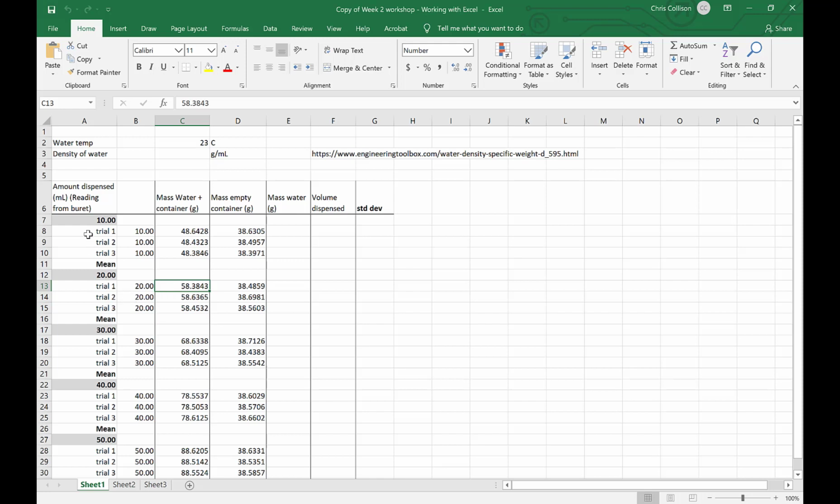So in fact, there are 15 separate measurements that are being carried out, and we recognize here the importance of multiple measurements to test for reproducibility, multiple measurements to enable us to do some statistical processes, multiple measurements that allow us to get closer to the truth when it comes to a good calibration of the burette.